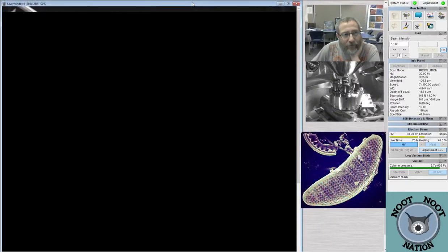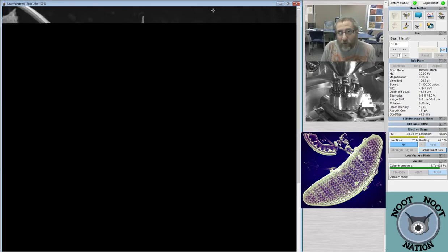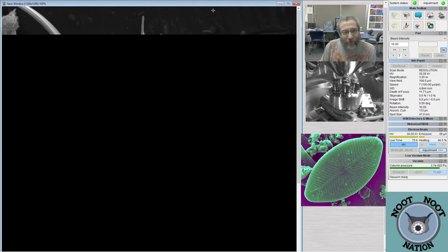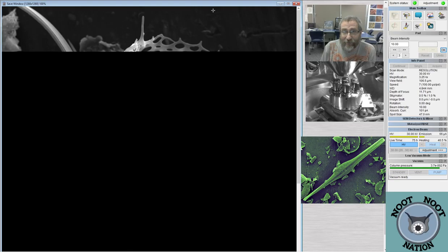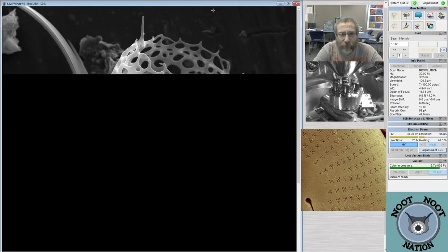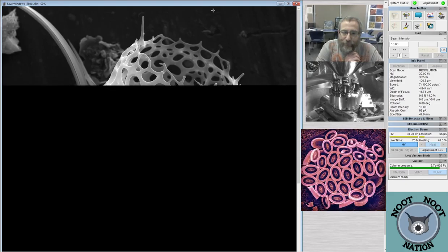But there's something called Calyptosporium or something like that, which looks like it could be a diatom, but it looks like it's the encysted form of another organism. So if you were going to give rise to diatoms, that might be an okay way to do it. It could be that diatoms are all actually formed from the cyst of another organism. It would explain a lot. It's a structure that kind of looks like a diatom in that it has two parts and a sort of operculum that seals up the bottom part of the organism. It's a question mark to us as to whether that's actually a diatom.